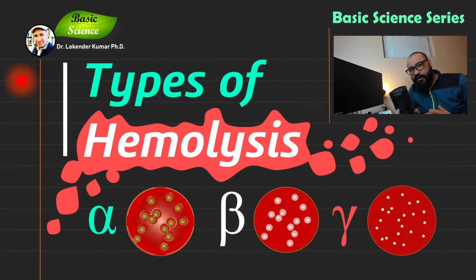In my previous video, I have also discussed Staphylococcus aureus, where I have discussed beta hemolysis in a very brief manner. But in this presentation, as I have already promised you that I will explain hemolysis in detail, I will explain alpha, beta and gamma hemolysis in detail. So I bring you this presentation today where I will explain these three important types of hemolysis.